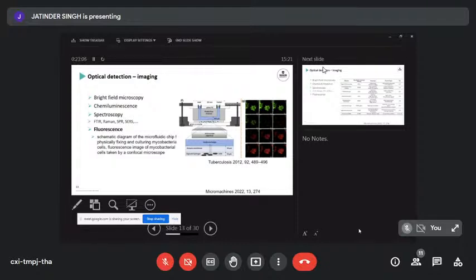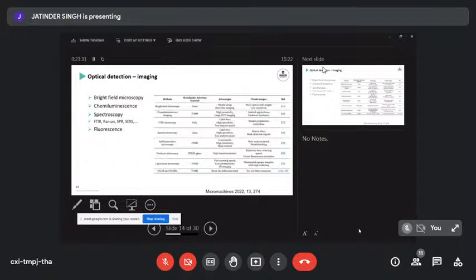You can see where the fluorophore has attached and where it hasn't, which helps the people studying, in this case, tuberculosis, to do their research better, having that all confined in a chamber where you have control over, for example, the efficacy of antibiotics being added. You can see if they die or not in your fluorescence microscopy images.